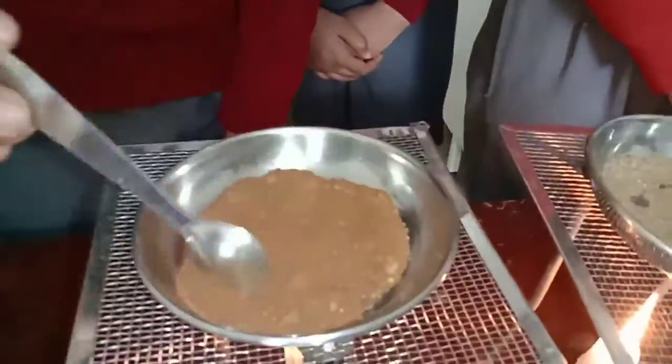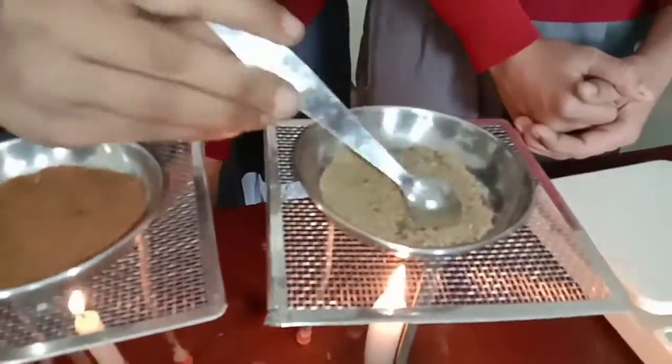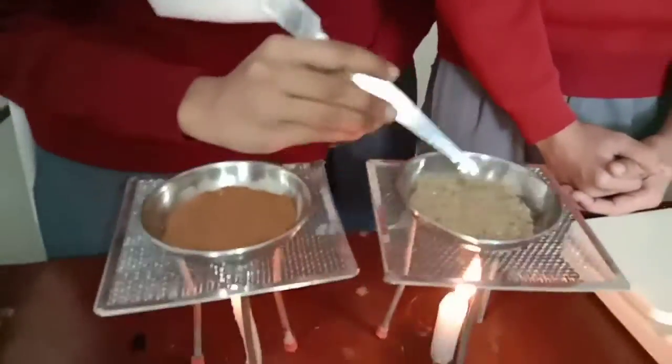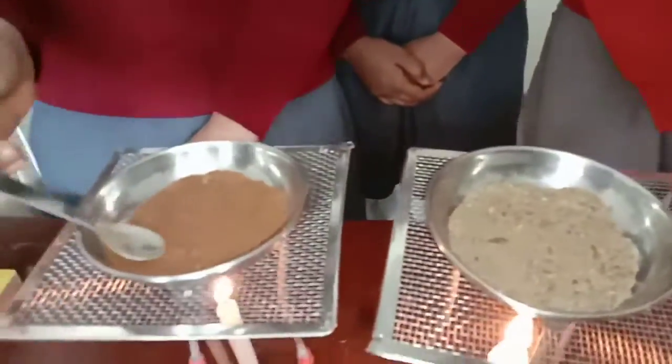We'll keep on agitating the soil with the help of spatula until it becomes dry. Usually it will take 10 to 15 minutes to completely dry.